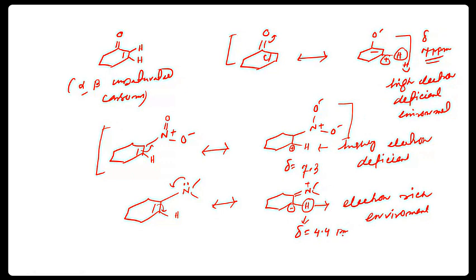So alkene protons are supposed to have a value like 5 ppm or 5 to 6. When I'm installing an electron rich moiety that can take part in delocalization, its value is just 4.4. Now you can easily understand by closing your eyes. Okay, the phenomenon I have read in the book, now I can totally visualize in terms of NMR spectroscopy. That's why you should always thank this spectroscopy. Thank you NMR spectroscopy. Because of all this spectra, you can understand clearly such types of electronic environment. I hope you are greatly enjoying this topic.